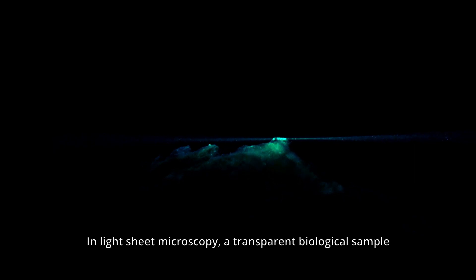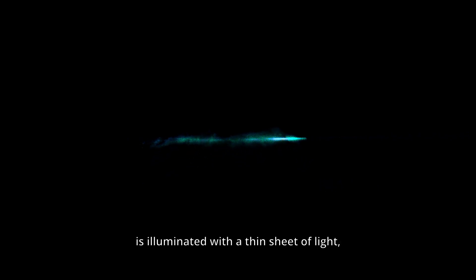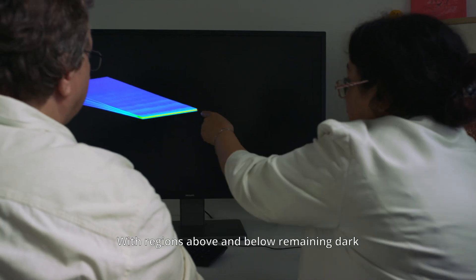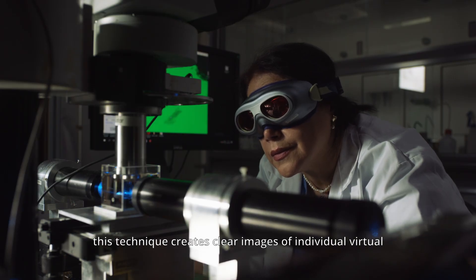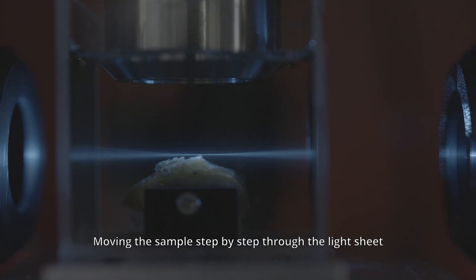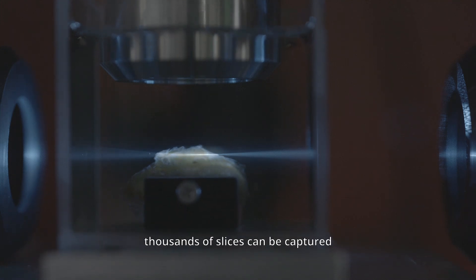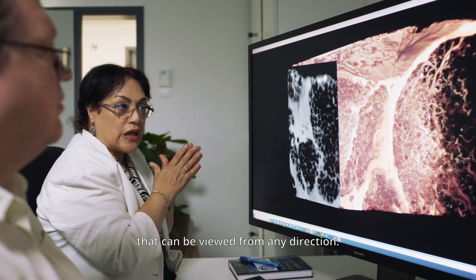In light-sheet microscopy, a transparent biological sample is illuminated with a thin sheet of light, causing it to fluoresce only in the illuminated areas. With regions above and below remaining dark, this technique creates clear images of individual virtual optical slices of the sample, much like a CT scan. Moving the sample step-by-step through the light sheet, thousands of slices can be captured and later combined to form a 3D model that can be viewed from any direction.